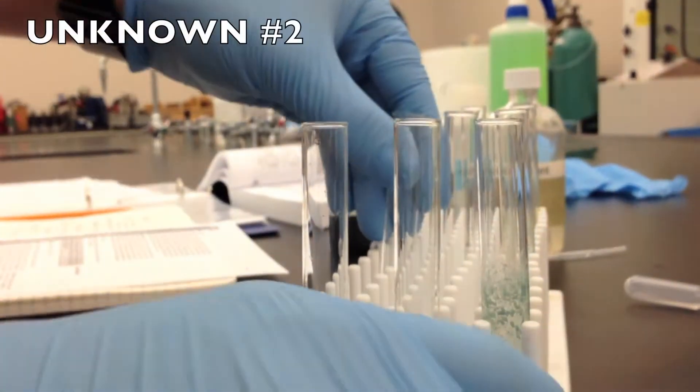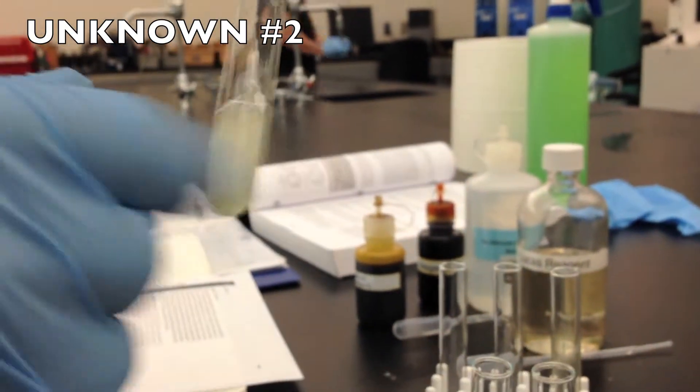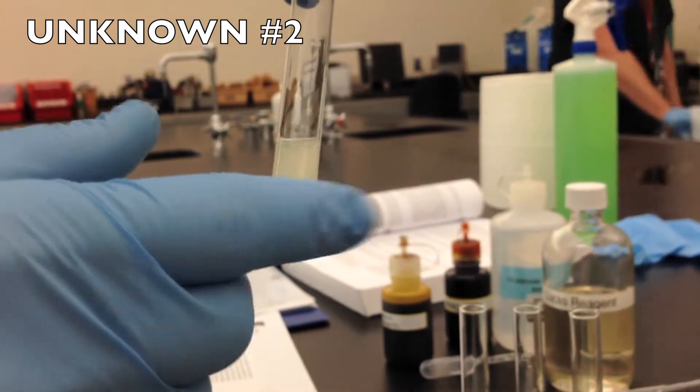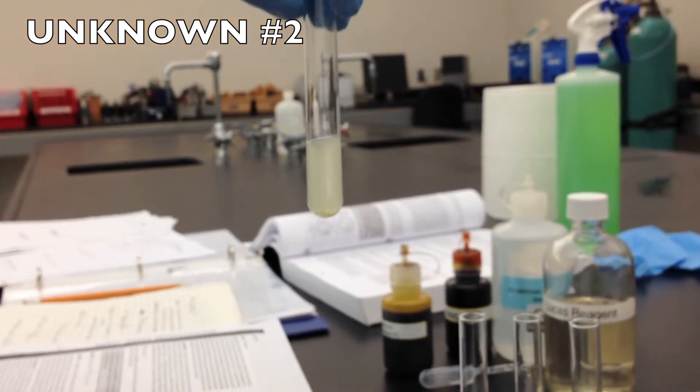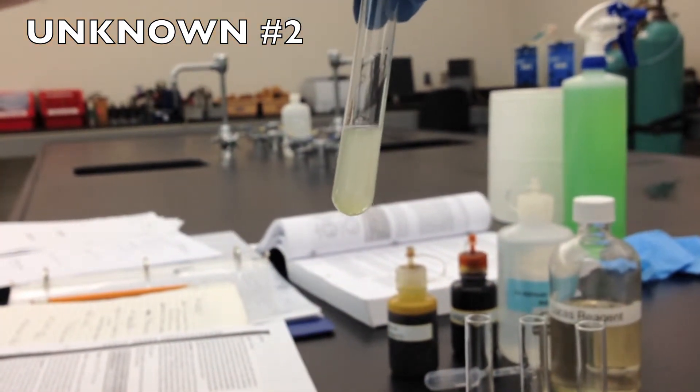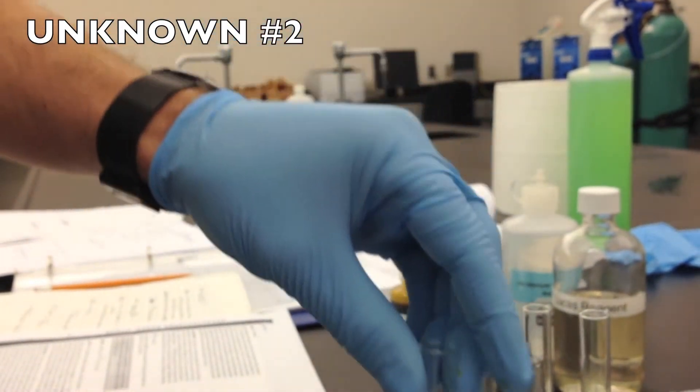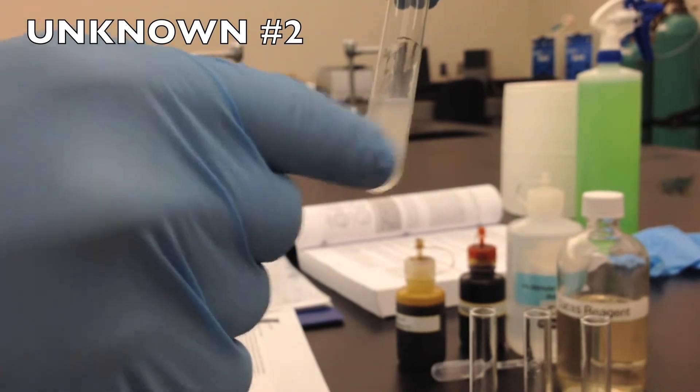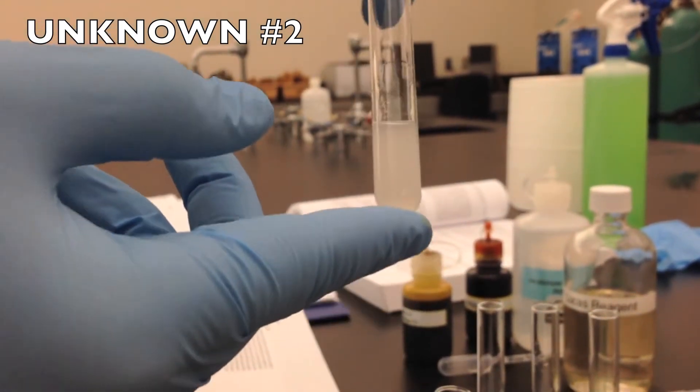Now with our second unknown, we got a positive result for the iodoform test. Which means it could only be a secondary alcohol. We also got a positive result later for the Lucas test, meaning it is either probably a secondary or could be a tertiary.